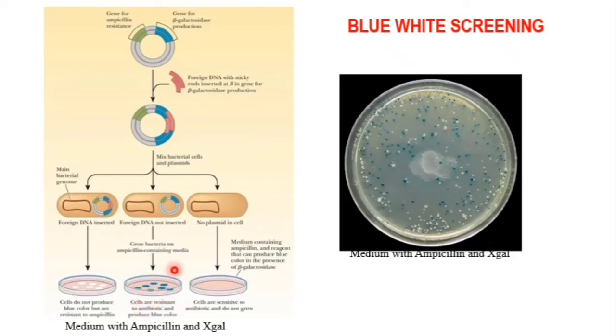Sometimes the foreign DNA is inserted outside the lacZ gene, and that time also it will produce a blue colored colony. Sometimes there is also a bacteria in this mixture that does not contain the vector. That bacteria cannot survive in the ampicillin containing medium.